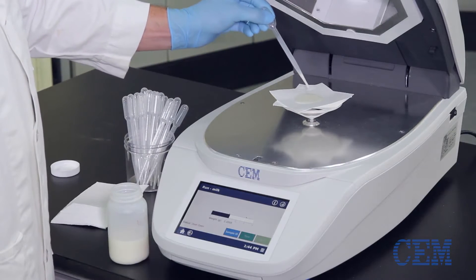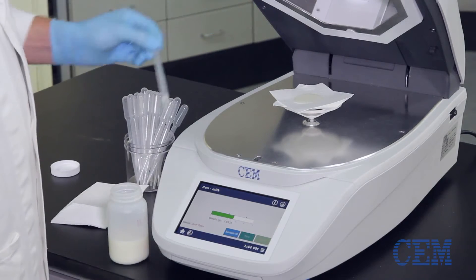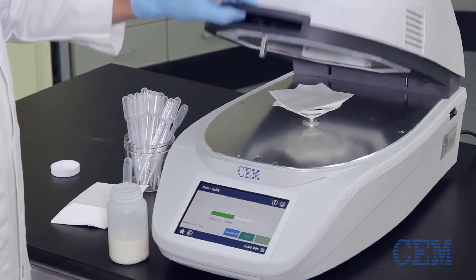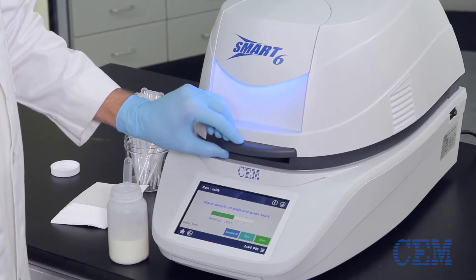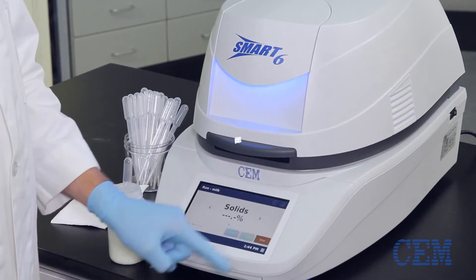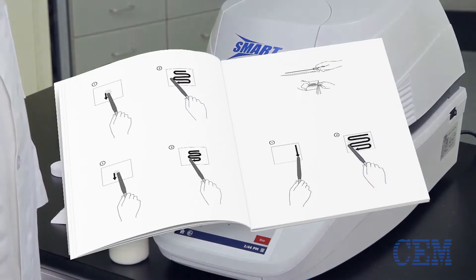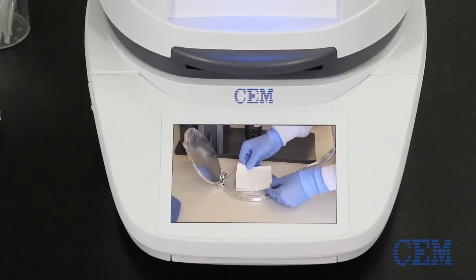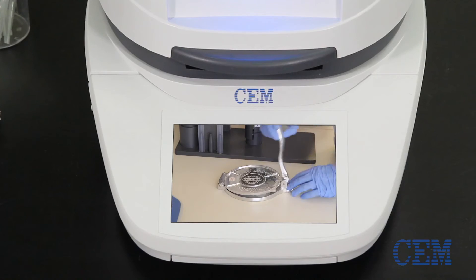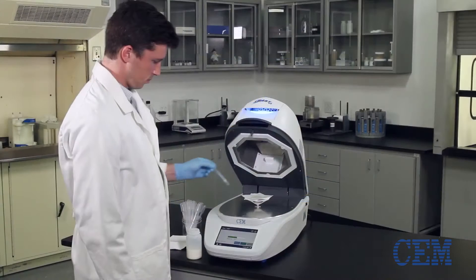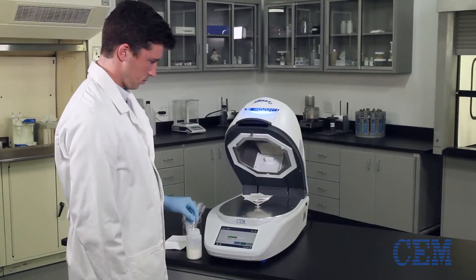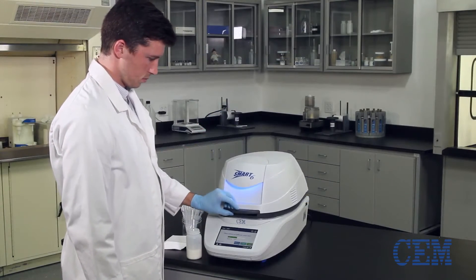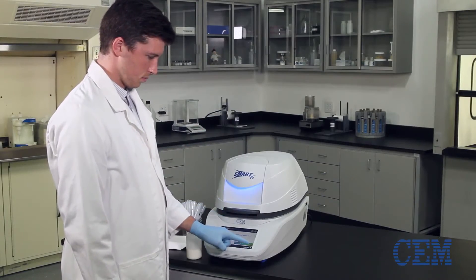Be sure the sample has been properly prepared and that you're using the correct sample spread technique. For more information on sample prep and spread technique, please refer to the operation manual or the sample preparation video residing in your Smart 6. Once your sample has been properly applied, place the sample and pads back on the balance, close the lid and press start.